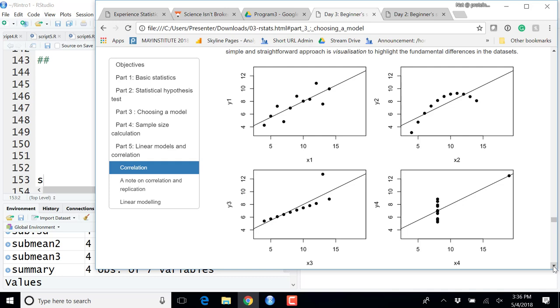But usually we just report the correlation, say 90% or 80%, but it can be like this case, right? Can you tell this is really correlated? No, right? So 2 things I want to address. First, don't believe too much in the correlation. And you always need to double check how the data look before you do any calculations. That's why visualization is very important. Visualization for summarizing the statistics is also very important to report and show your result, right? However, before you start any data analysis, it's very important to check the data first.